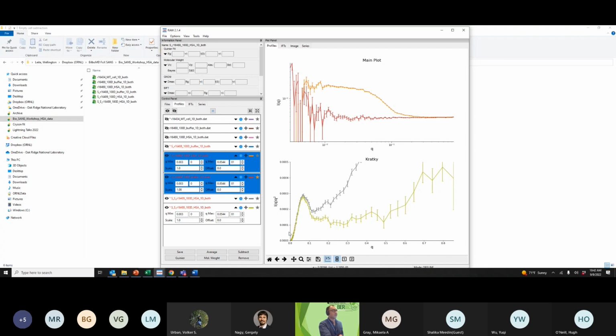If you have a disordered structure, an intrinsically disordered protein, for instance, it is not going to have this bell shape. It's going to be more of a flat line in the high-Q region here, which is what you should expect for a non-structured protein. Okay, it tells me that I need to apply more background. I'm going to be a little bit cautious here, but just increase to 85 and do the subtraction.